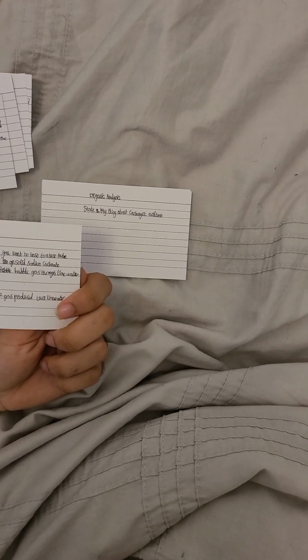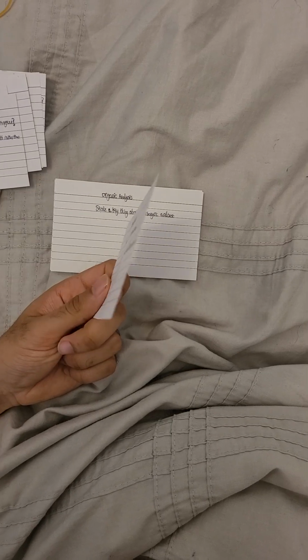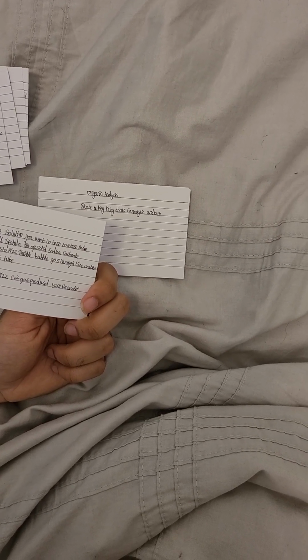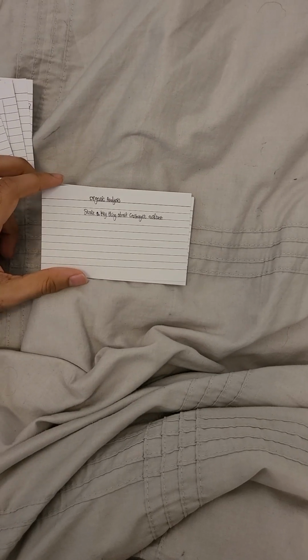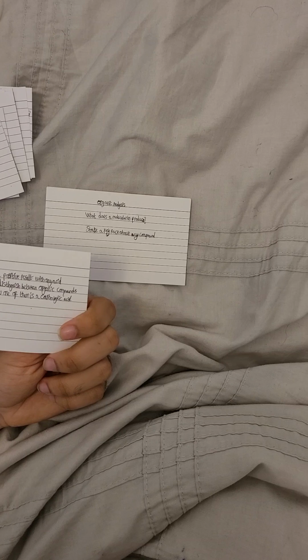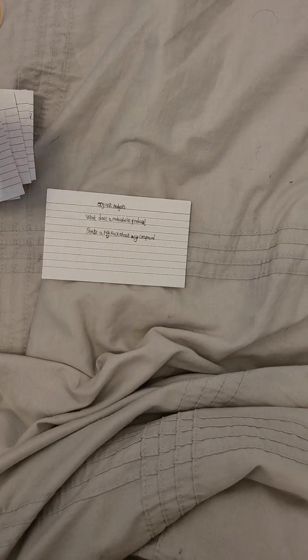Test for carboxylic acid. Add 2 cm³ of the solution you want to test to a test tube. Add 1 small spatula of solid sodium carbonate. The solution begins to bubble, and the gas produced is bubbled through limewater in a second test tube. The carboxylic acid test will give a positive result with any acid, so we can only use it to distinguish between organic compounds when we know one of them is a carboxylic acid.